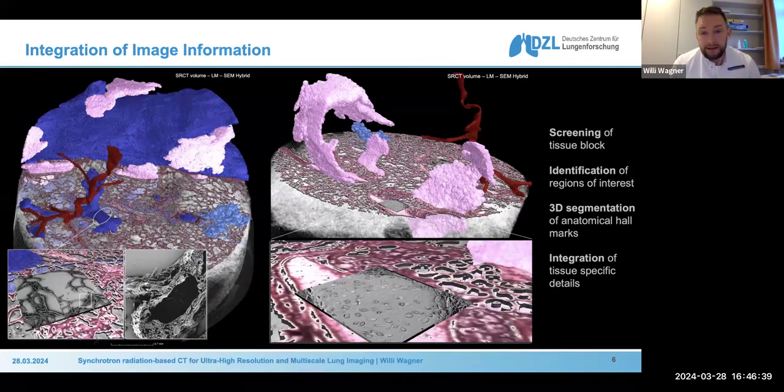And again, the airway components, the stuff that in the living animal would be filled with gas, is void space here. So you actually only see the lung tissue.